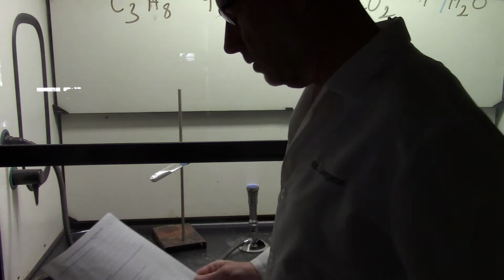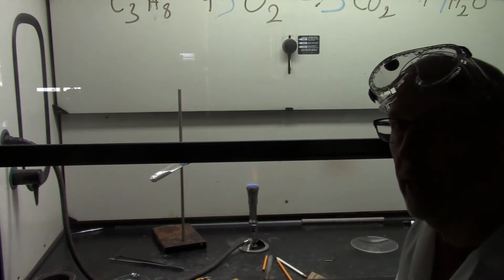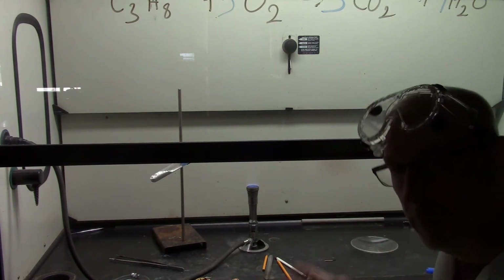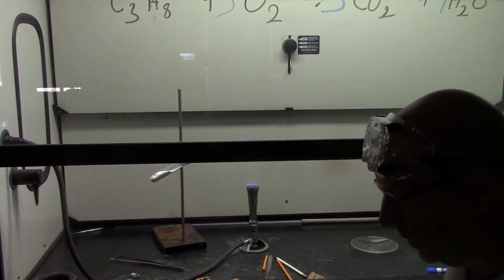Are these reactions exothermic or endothermic? Exothermic means give off heat. Endothermic means take in heat. Exothermic reactions feel hot. Endothermic reactions feel cold. So you figure out what this is.